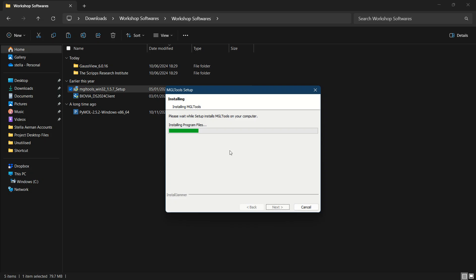The installation has now begun. Depending on how fast your drive is will determine how long this takes, but it doesn't take a lot of time — just a minute or two for the installation to complete.